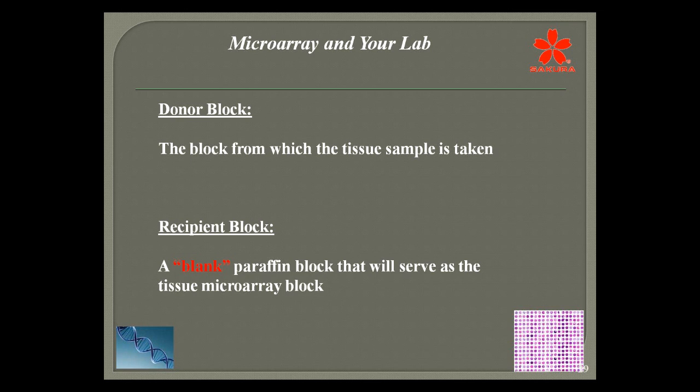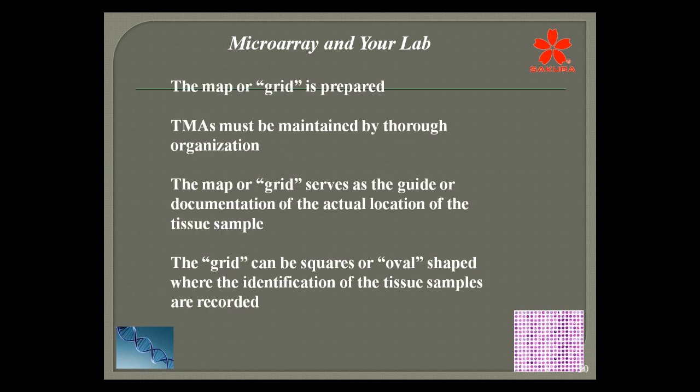So most likely you're going to choose an in-between or a mid-size embedding block, or the very large, because you certainly are going to have a lot of space to make these, and you don't need to be a very small block. They need to be a very good-sized block.